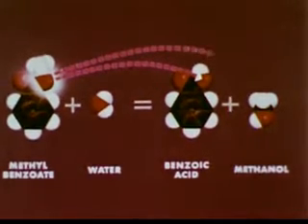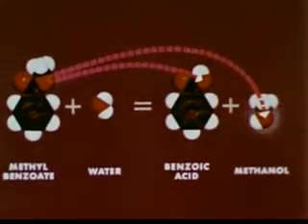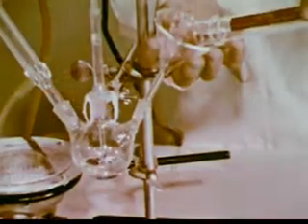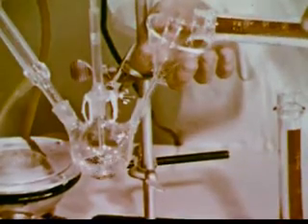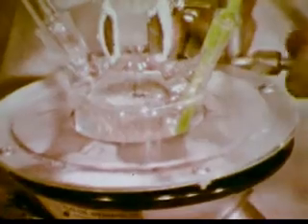Or it could end up in the alcohol molecule. Now let's perform the hydrolysis and see where it does go. The hydrolysis is performed in the same manner as before, but using the labeled ester. The reactants are placed in the flask, which is stirred and heated.